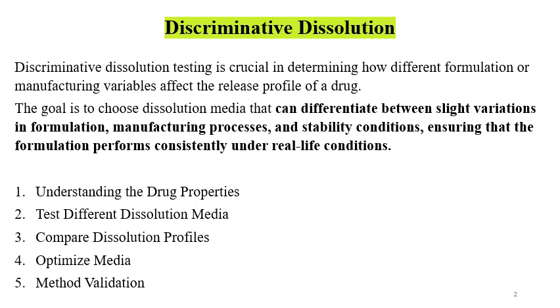So the discriminative dissolution can differentiate between slight variations in formulation, manufacturing processes, and stability conditions, and that's why ensuring that the formulations perform consistently under real life conditions.